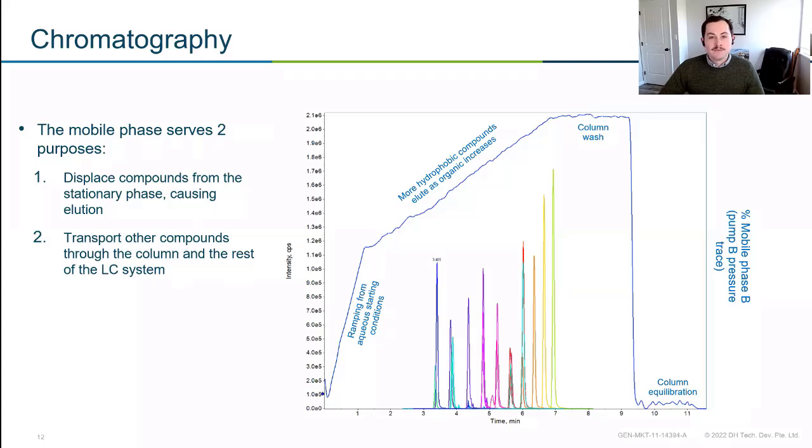Once that step's done, we're going to do the equilibration phase, another really important phase, which again is related to the dimensions of your column. So we want to make sure we've gotten all that organic out of our column and are starting our next injection at the exact conditions we started our first injection. If we choose to skip this step, what would happen is our column won't be equilibrated and our peaks will slowly start to creep up in our chromatogram. And we really want to avoid that and make sure that we have steady retention times.